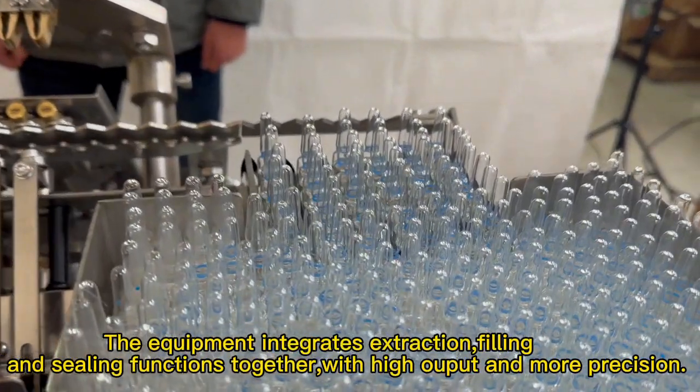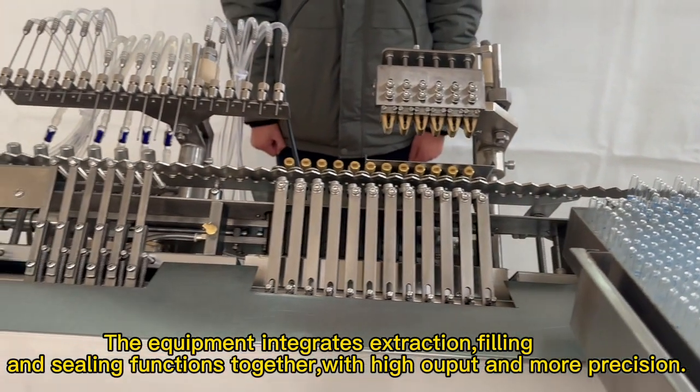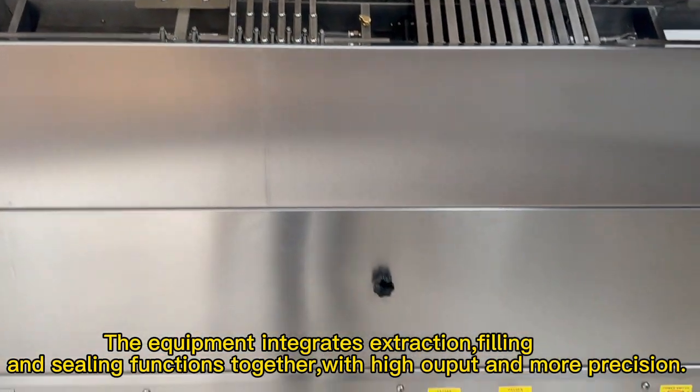The equipment integrates extraction, filling, and sealing functions together with high output and more precision.